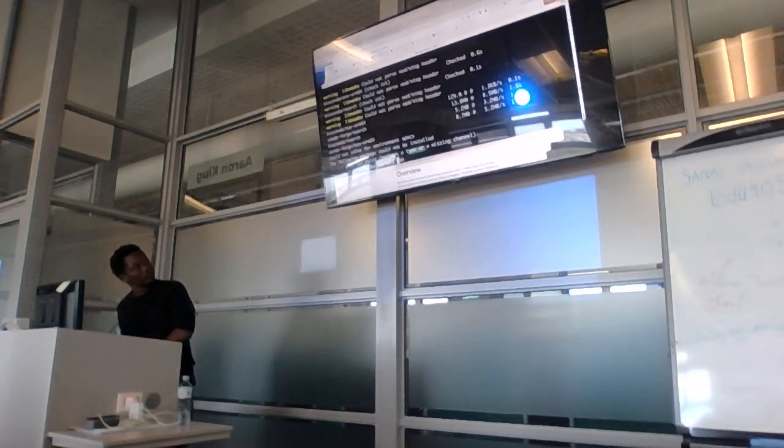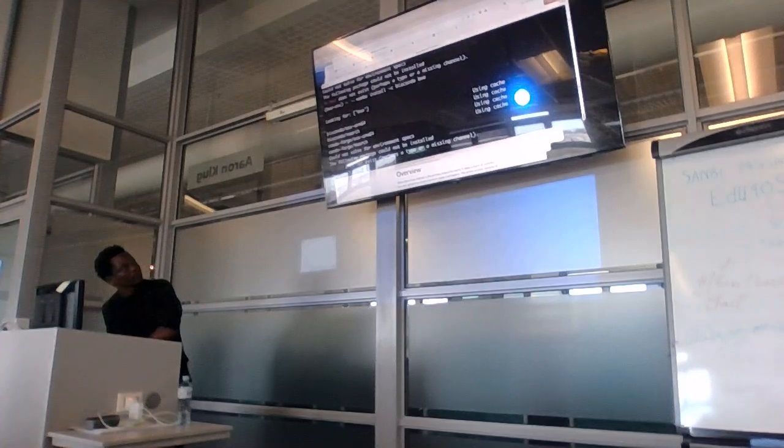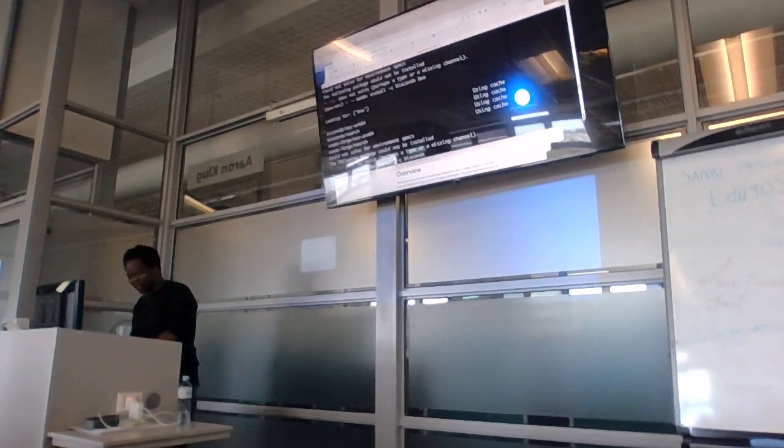So there we go, you did -c, and then you put the channel. That's -c bioconda, right? Yeah, there we go. No, it's not happy. Does BWA actually live in bioconda, or does it have a different name?